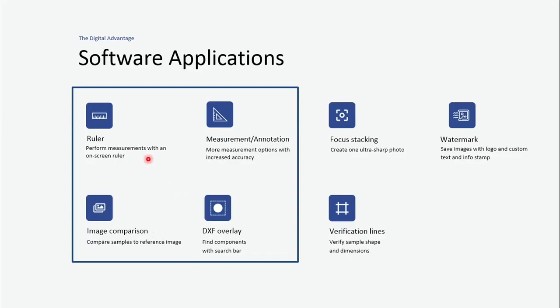We also have a ruler, which is similar to a graticule on screen, so you can make measurements right on screen. We also have another app where you can make substantially more accurate measurements, create annotations, and save these images for documentation purposes.